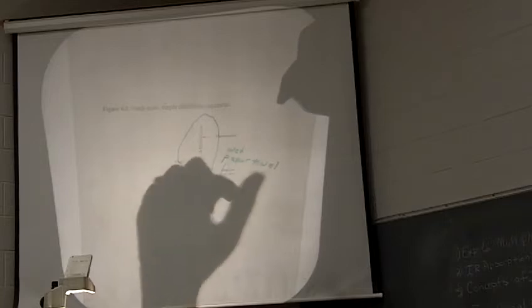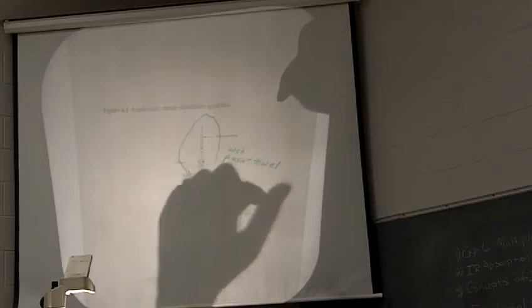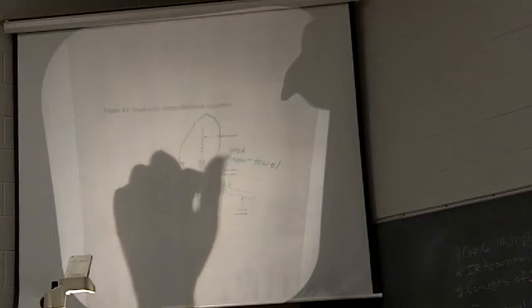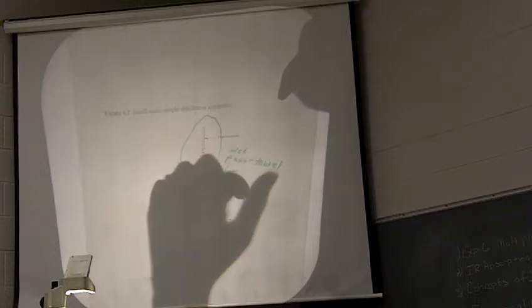And then as it condenses over, if you're using the sidearm test tube, make sure it's pointed up, not down. Otherwise, your unknown will drip out as it comes over, okay? So make sure you don't lose your unknown as it's being distilled. When you add unknown to this, make sure you use your stemmed funnel so it goes past this arm, or you may have to tilt it to the side a little bit so it doesn't all run out the arm when you're trying to put it in there as well, okay?